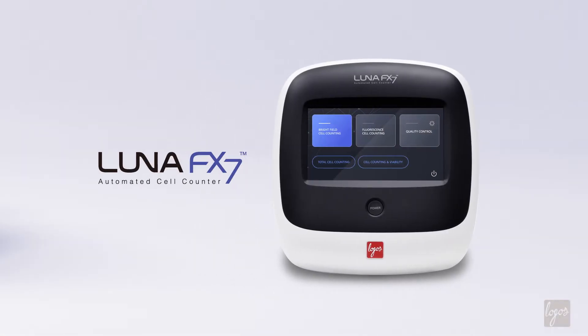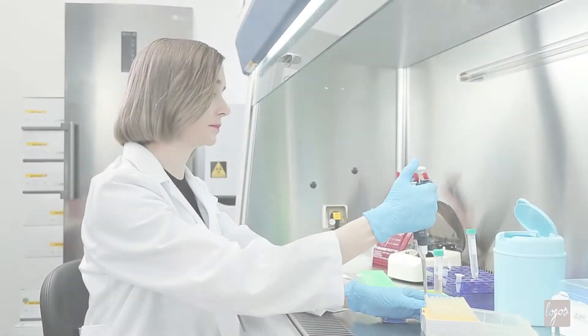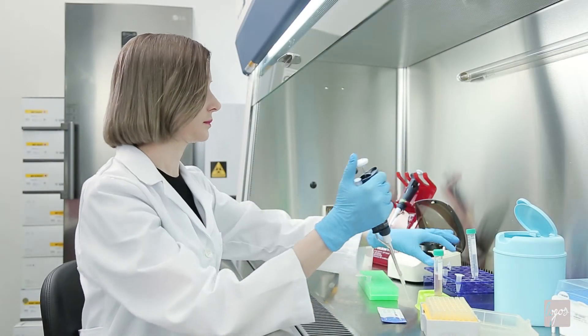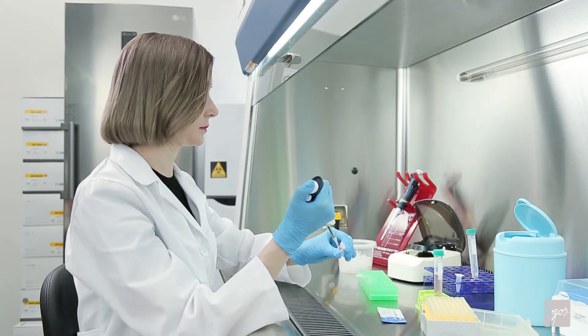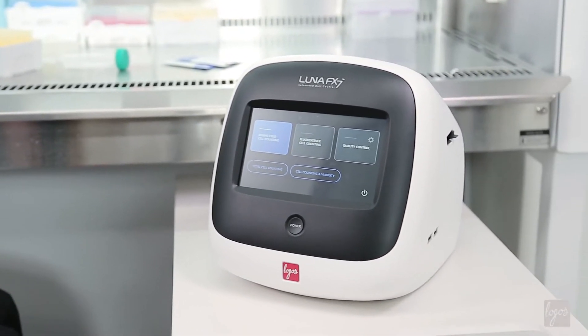Introducing the LUNA FX7, the most advanced automated cell counter among the award-winning LUNA family. With unmatched cell counting accuracy, higher throughput, state-of-the-art optics, and advanced software.